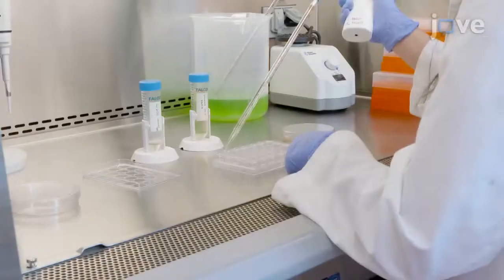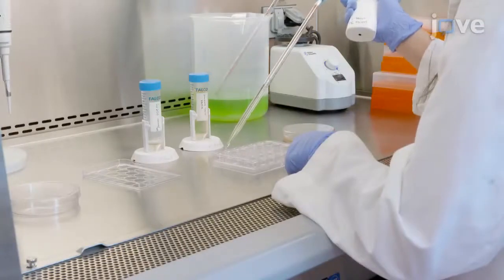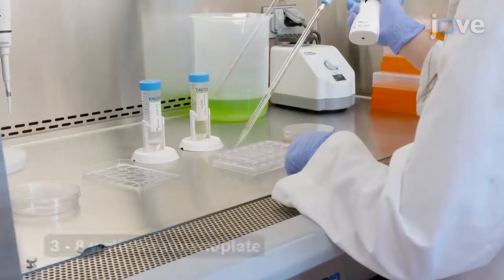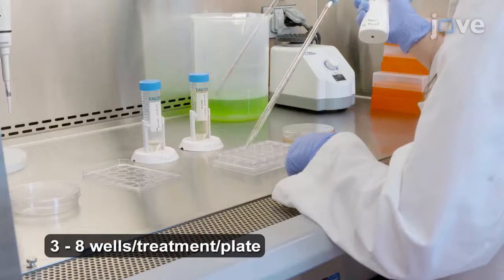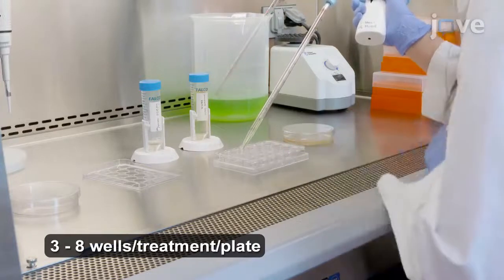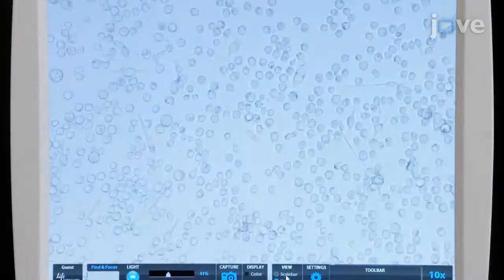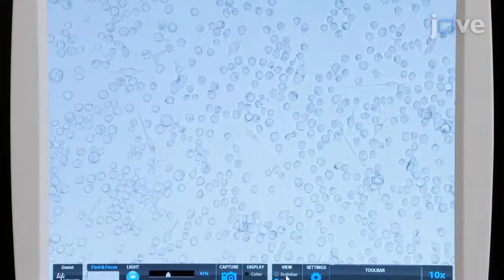After this, transfer 1 milliliter of the diluted culture to each well of a 24-well plate. Then, allow the cells to settle for at least 1 hour.